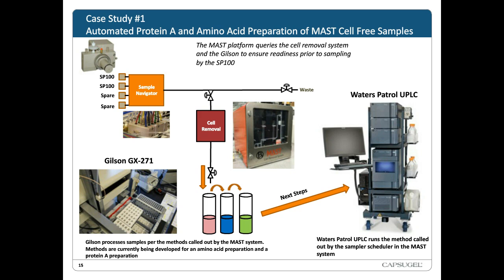For this particular application, the sample is split, and one part of the sample goes through a protein A process, and the other part runs an amino acid preparation. Currently, the next step we're working on is the integration of sending that sample to a Waters Patrol UPLC, and that's the part we're working on right now.